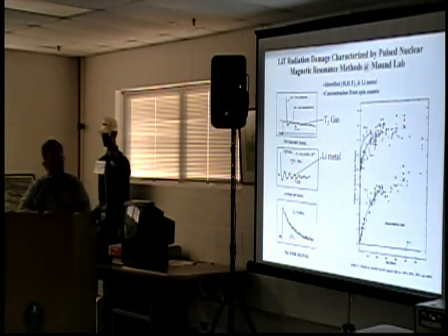Now, I'm afraid this next chart's going to be a little hard to see, but this is the amount of trapped tritium at different storage temperatures. The bottom one here is minus 40 degrees C, and we stored material and we see no trapped tritium. There's no damage, no formation of molecular tritium. At room temperature, you see this fairly fast decay. There's actually a couple different samples in this, and we see that there's scatter in the data, but there's a trend that up to 7 or 8% of the total amount of tritium in the sample is now trapped in gas bubbles. If we go to 75 degrees C or 100 degrees C, we're getting somewhere between 15 and 18% of the tritium is now not in the solid phase, but in the gas phase, in these bubbles.